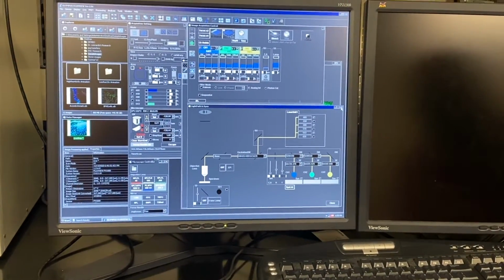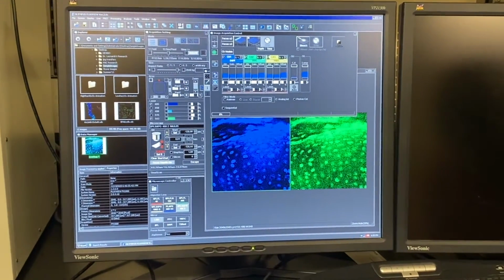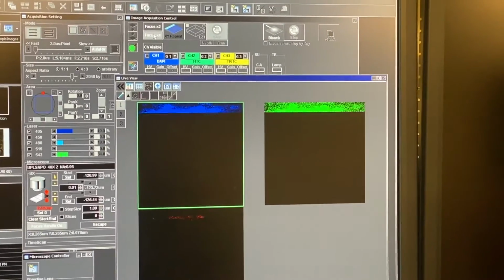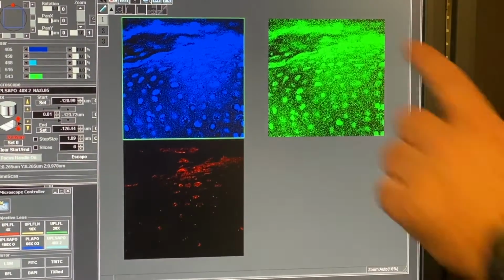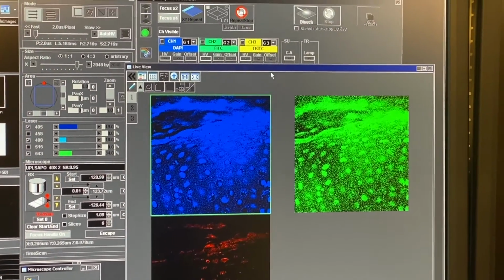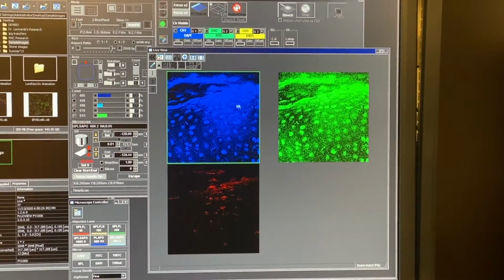So I'm going to close the light paths and dyes, and now that I've got this third one turned on, because it wasn't turned on before, right? I've got it turned on, focus 4X, and now I got three colors. Tritsy is shown in yellow rather than in red because there is a Texas red, a darker red, but this is exactly the red that we want. So now we can see red, blue, and green.